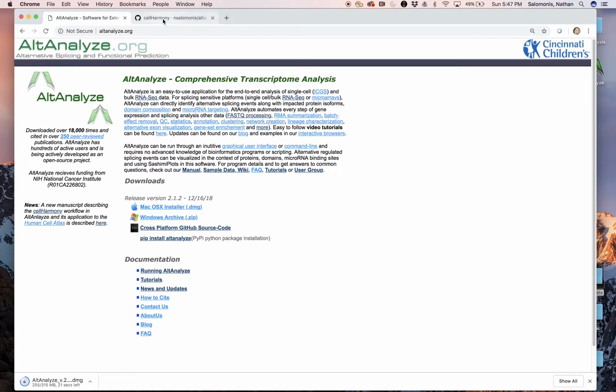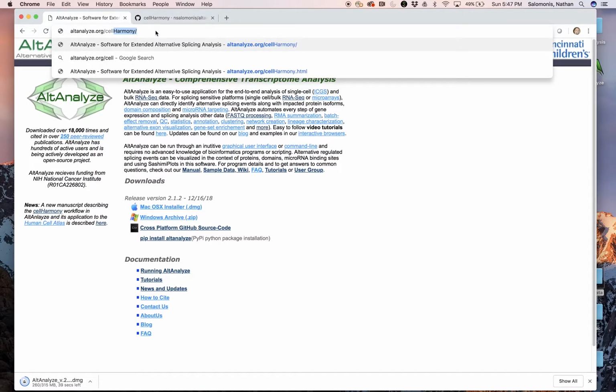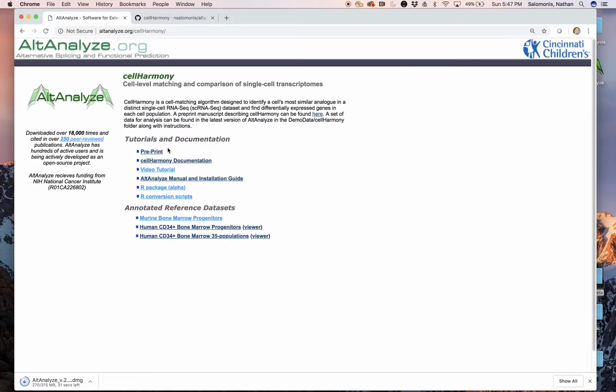So first off, you'll want to go to the cellHarmony main page at AltAnalyze, which is altanalyze.org, cellHarmony. From here, there's a number of links, including the cellHarmony documentation, a video tutorial, the video tutorial we're watching right here, which would be crazy if we actually were able to click on this. The AltAnalyze manual, instructions and documentations.